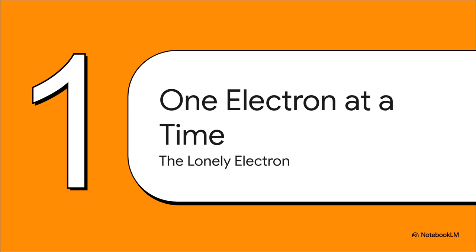All right, first things first. We need to get a handle on just how lonely these electrons really are. Because inside what's called a transmission electron microscope, or TEM, each electron is basically on a solo mission. And that right there is the whole secret.